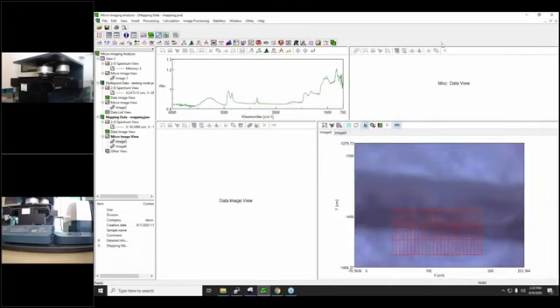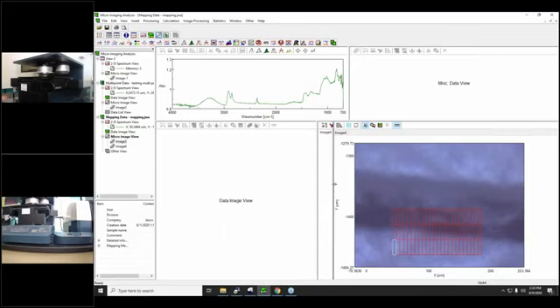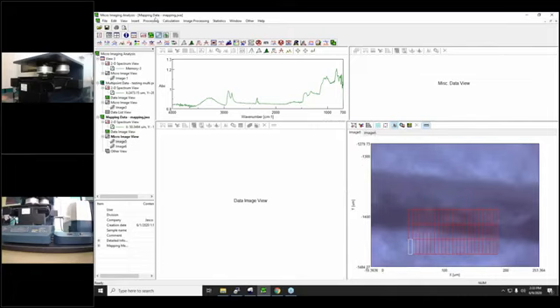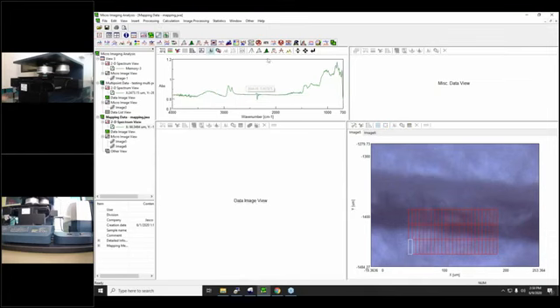And this is how it looks. We have the array, and we can click on every square and check the spectrum in each one. Since this is an array and we already took the map, I'm going to show you how to create the map. So first, what we do is just send this map here.